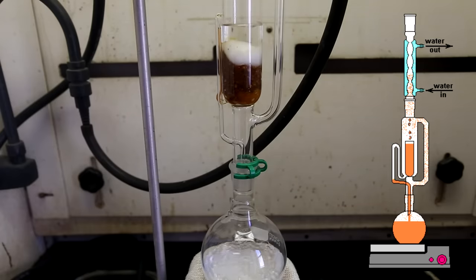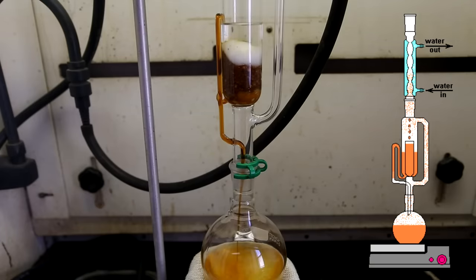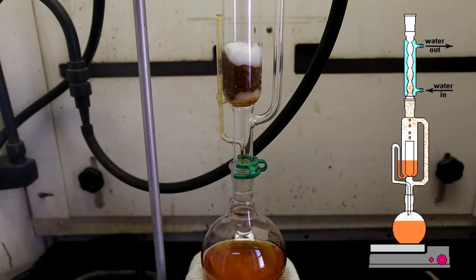As some of the solvent passes the 180 degree bend, the solvent will enter the descending portion of the siphon tube. The solvent in the descending portion will fall due to gravity and behind it create a suction. This will lead to the emptying of almost all of the solvent from the main chamber. This is one complete cycle of the Soxhlet extractor.